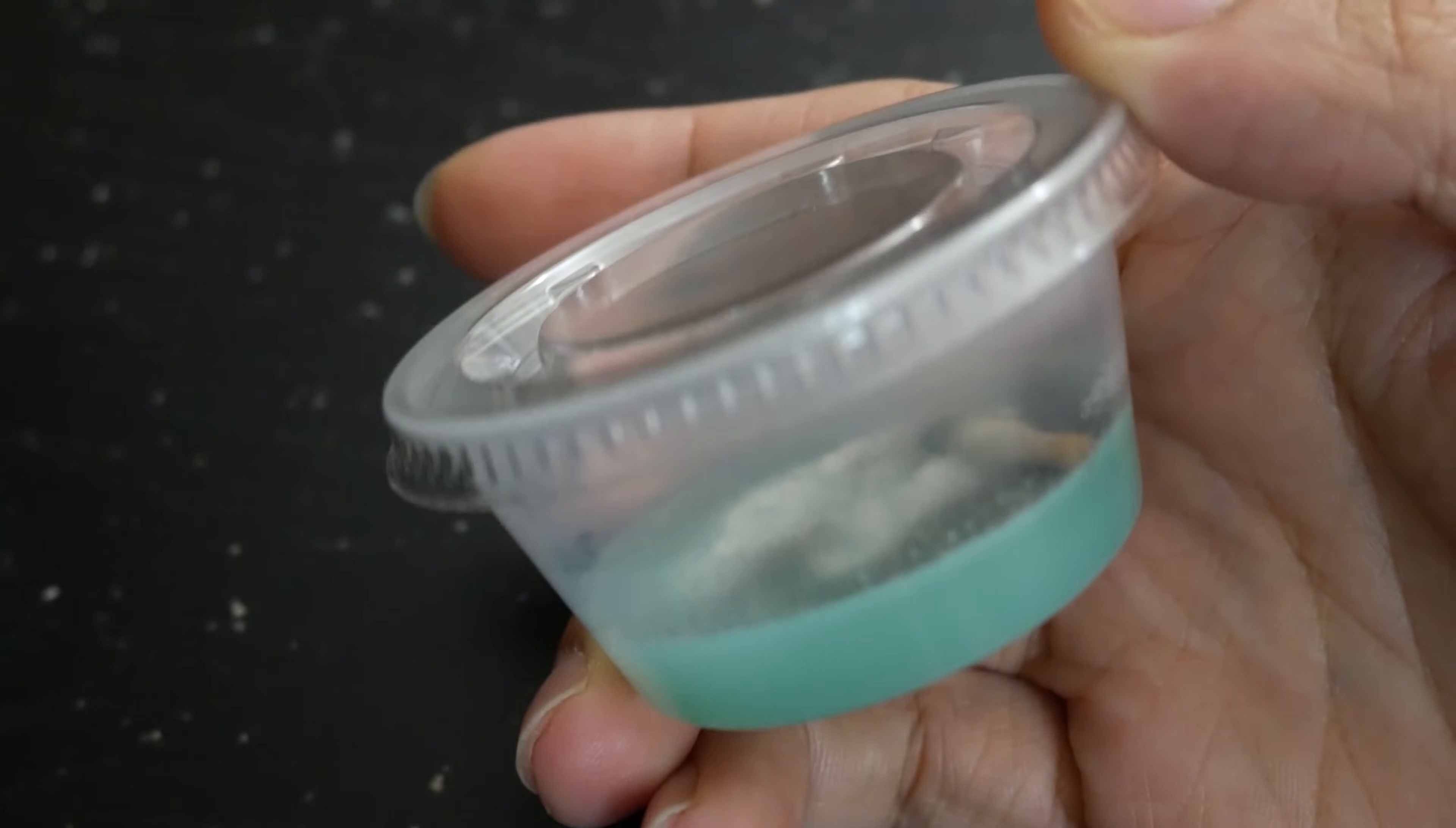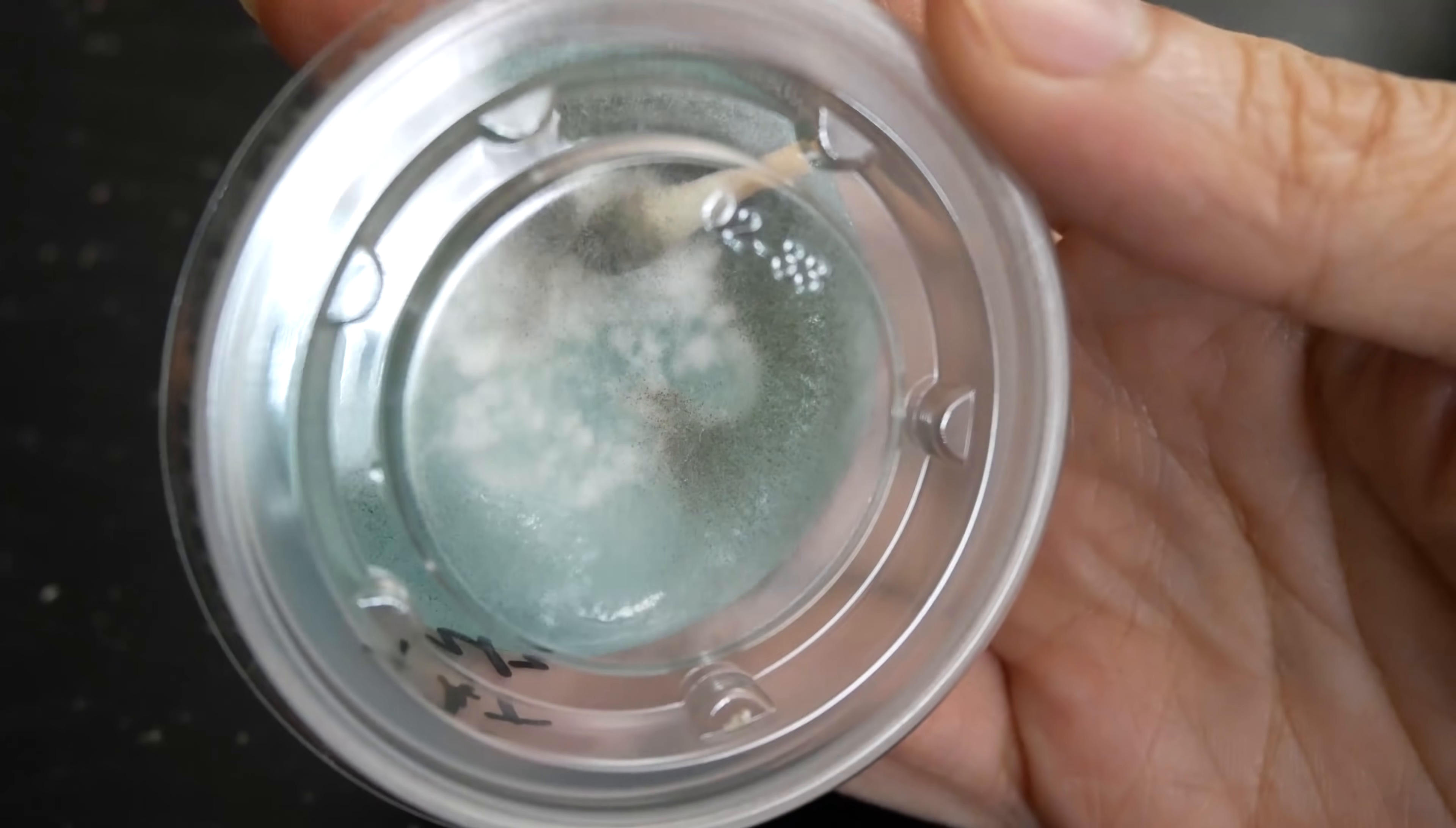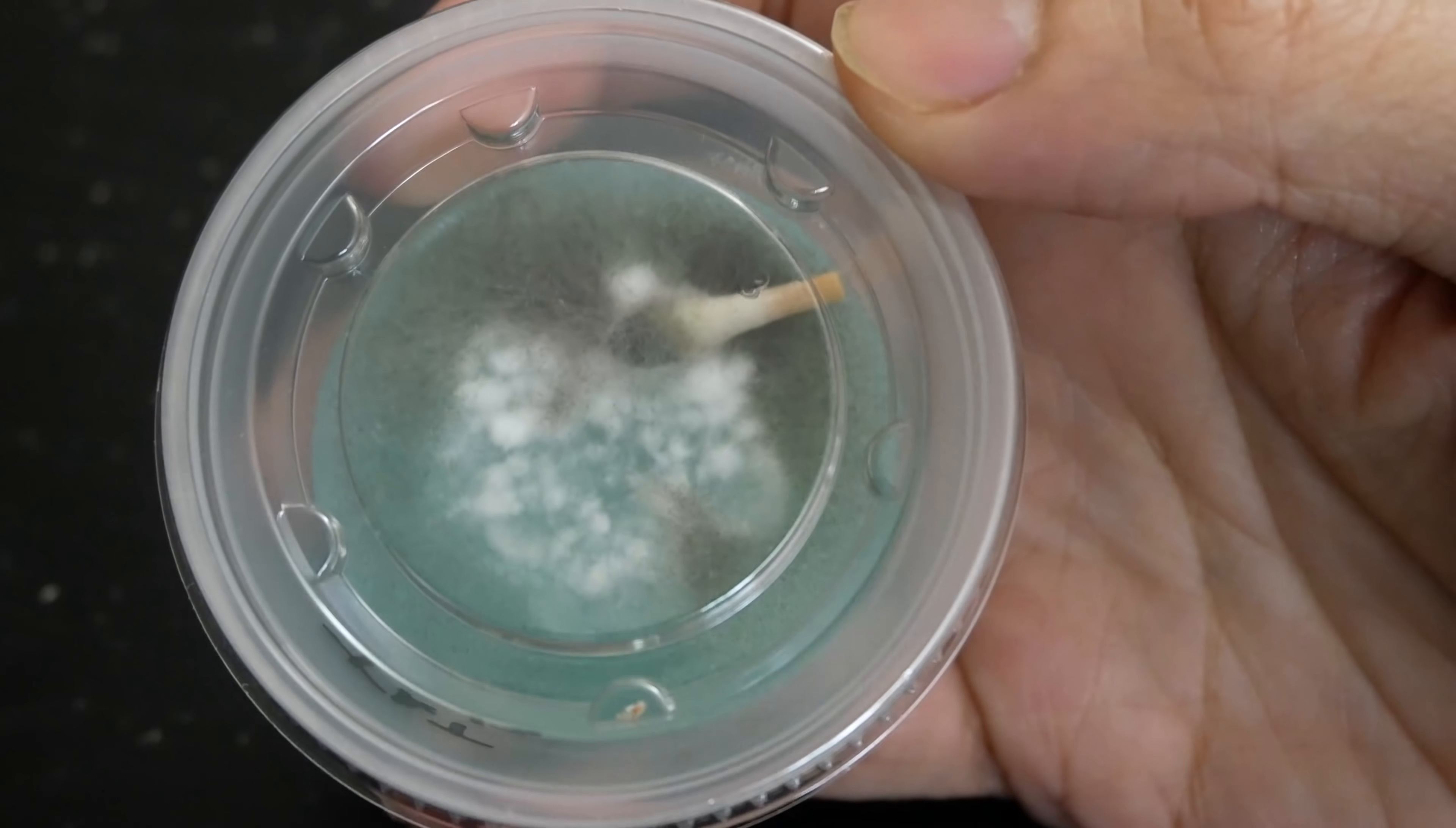Unfortunately, I've let this cup gone a little bit too far and the pin mold's taking over a majority of the real estate inside of this dish. So it's going to be very difficult to try and clean this up from the contamination. I figured it'd be very neat to show you guys what contaminations would look like when you're germinating from spores.